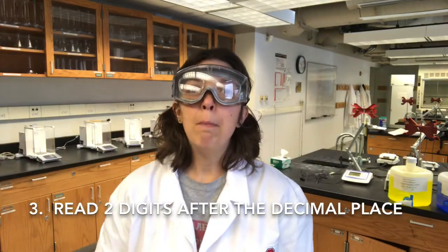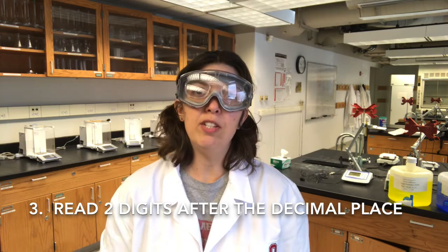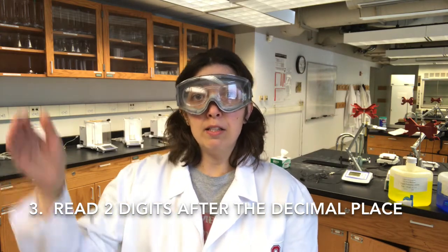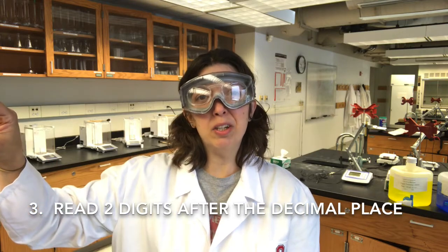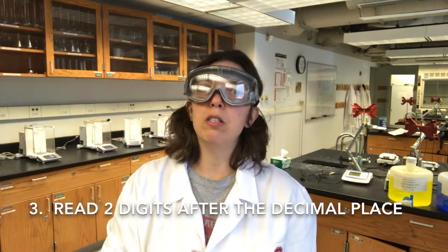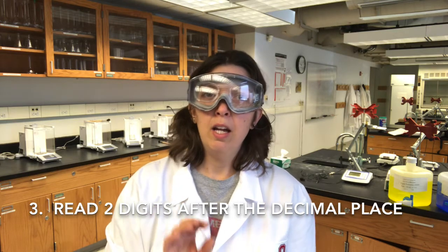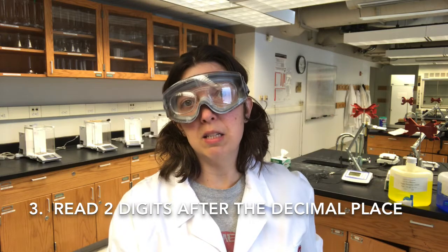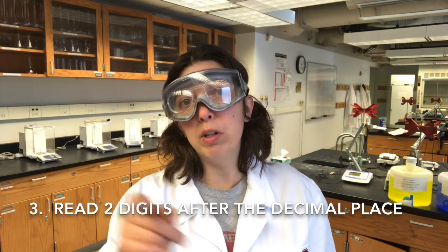Tip three: make sure you're reading two digits after the decimal place on the burette. The burette has milliliter markings — long lines for those — and every 0.1 milliliters is also marked with a line. Now, think about this: you have to get one more digit in addition to that point-something.